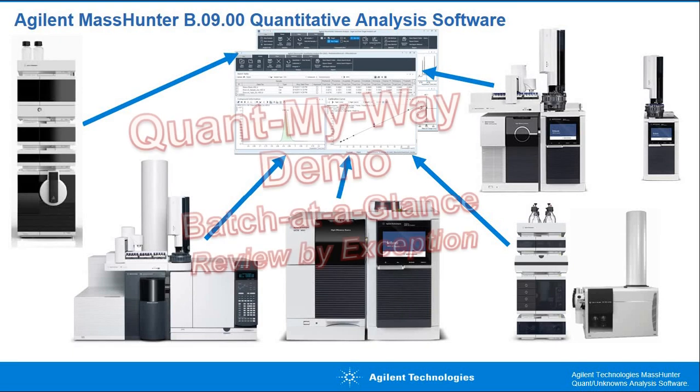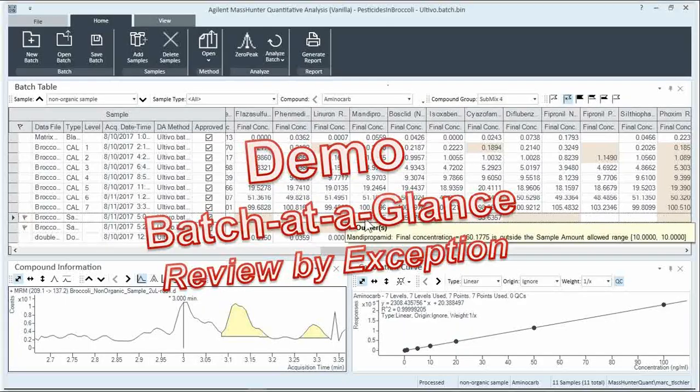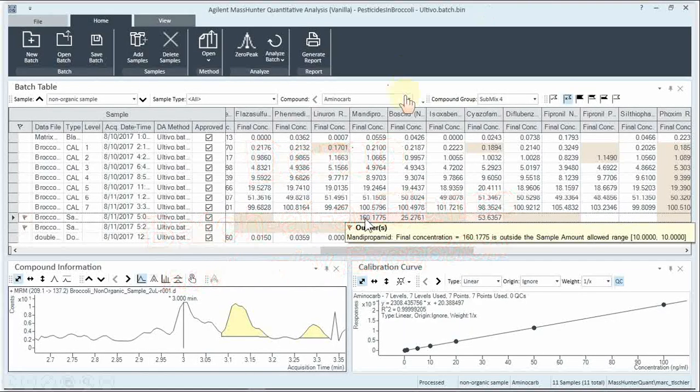Let's take a look at the Quant-My-Way demo, batch at a glance review by exception. In this demo, I'm going to show you batch at a glance, which really works for people who like numbers and tables. And there is the vanilla simplified ribbon. I will show you that usage along with the customization of the toolbar and the context menus.